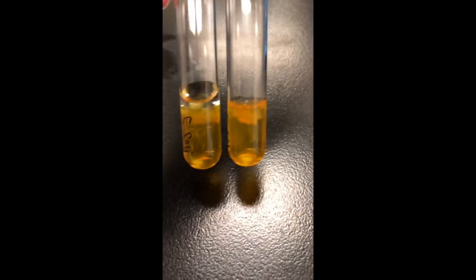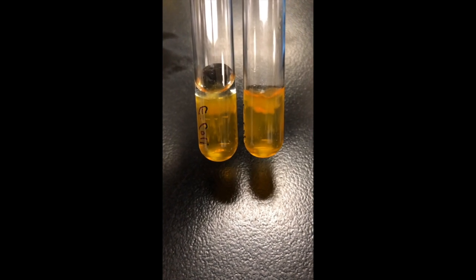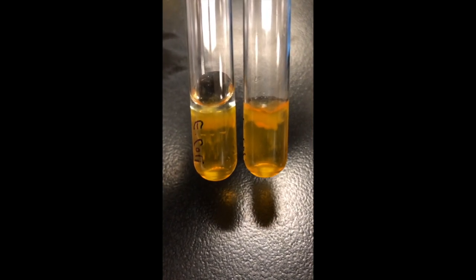We're going to go over some of the results of the test that you did yesterday. I'm going to start with your OF test. Remember, these tubes started green. We're going to start with your E. coli. Notice for these, both the fermentative tube and the oxidative tube turned from green to yellow. This tells me that my organism is fermentative.